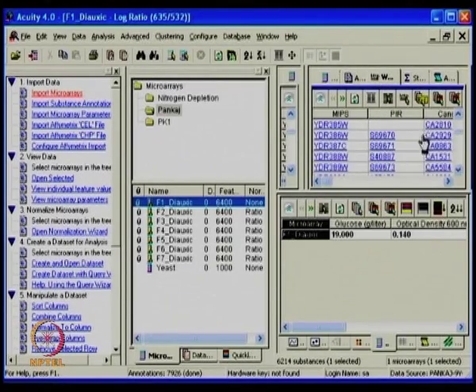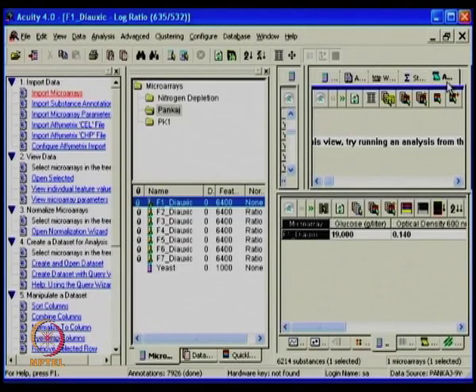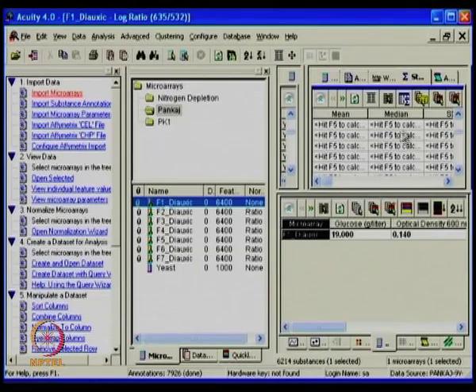And the other one also gives a little bit of other details in the form of statistics, warehouses, and a few of the auto scripting capabilities which advanced users sometimes want to use. But this one particular statistic will allow you to see what all you want to see, which we see in detail. In the bottom, what you essentially see is how the data is looked at.